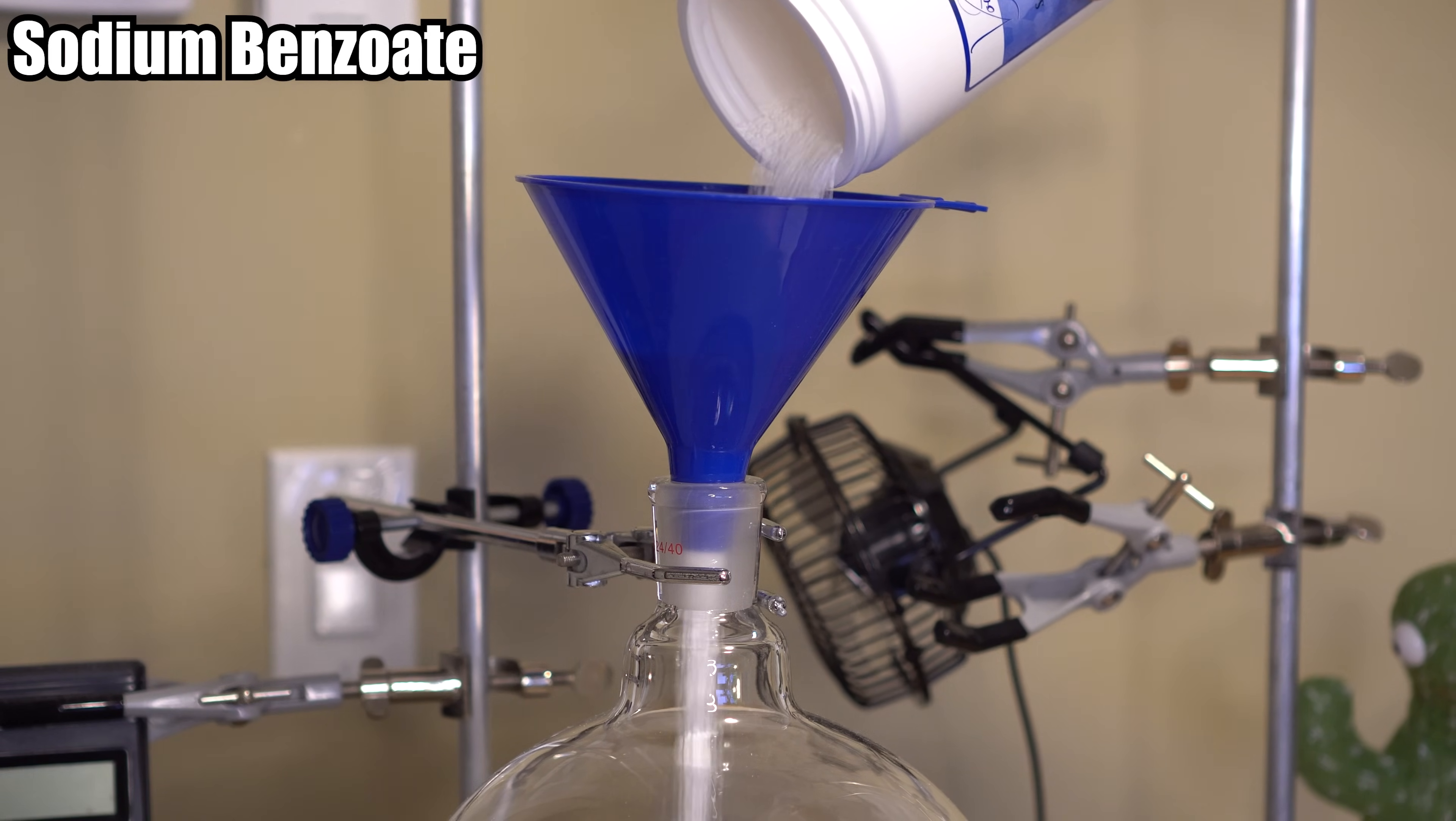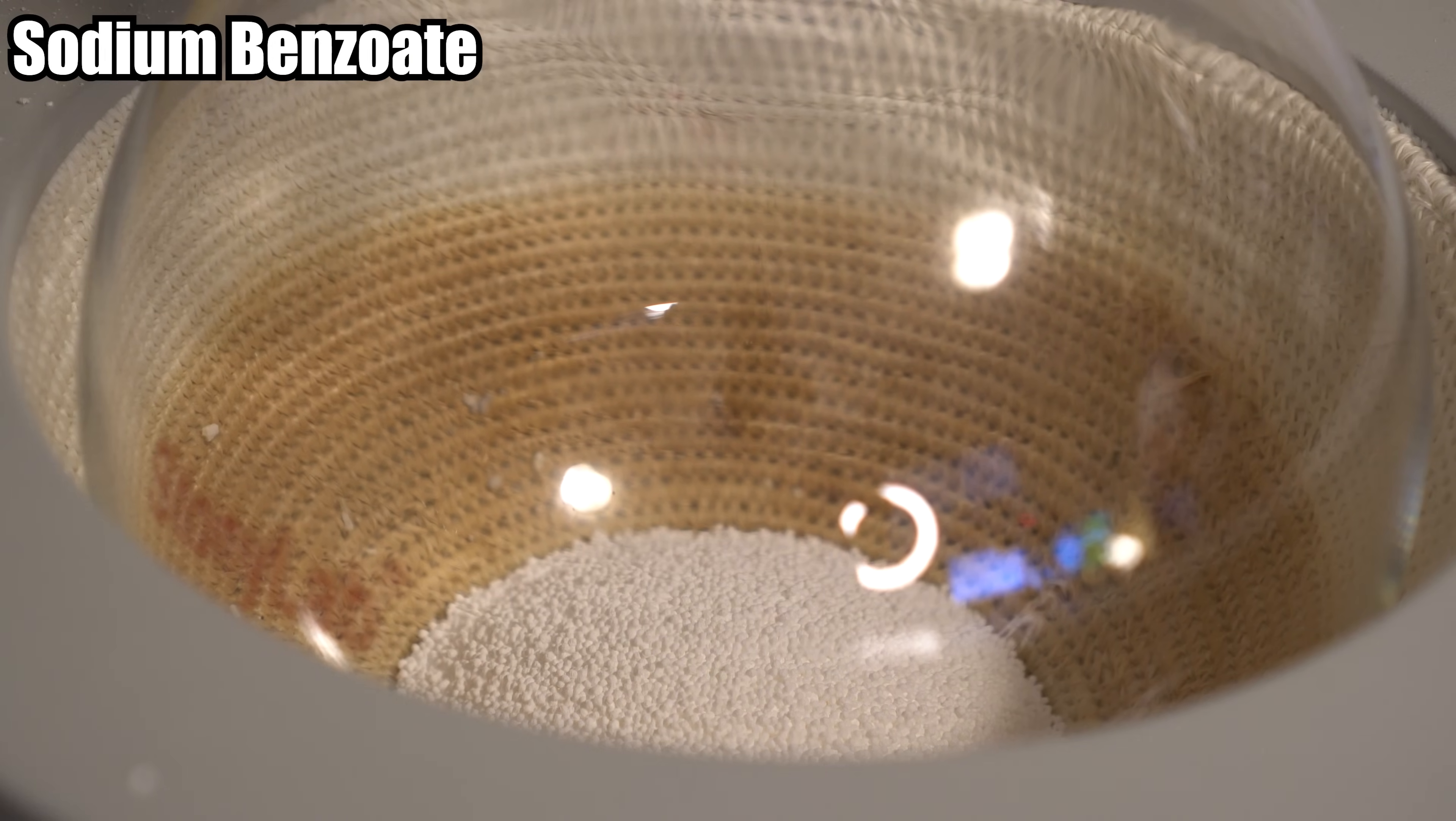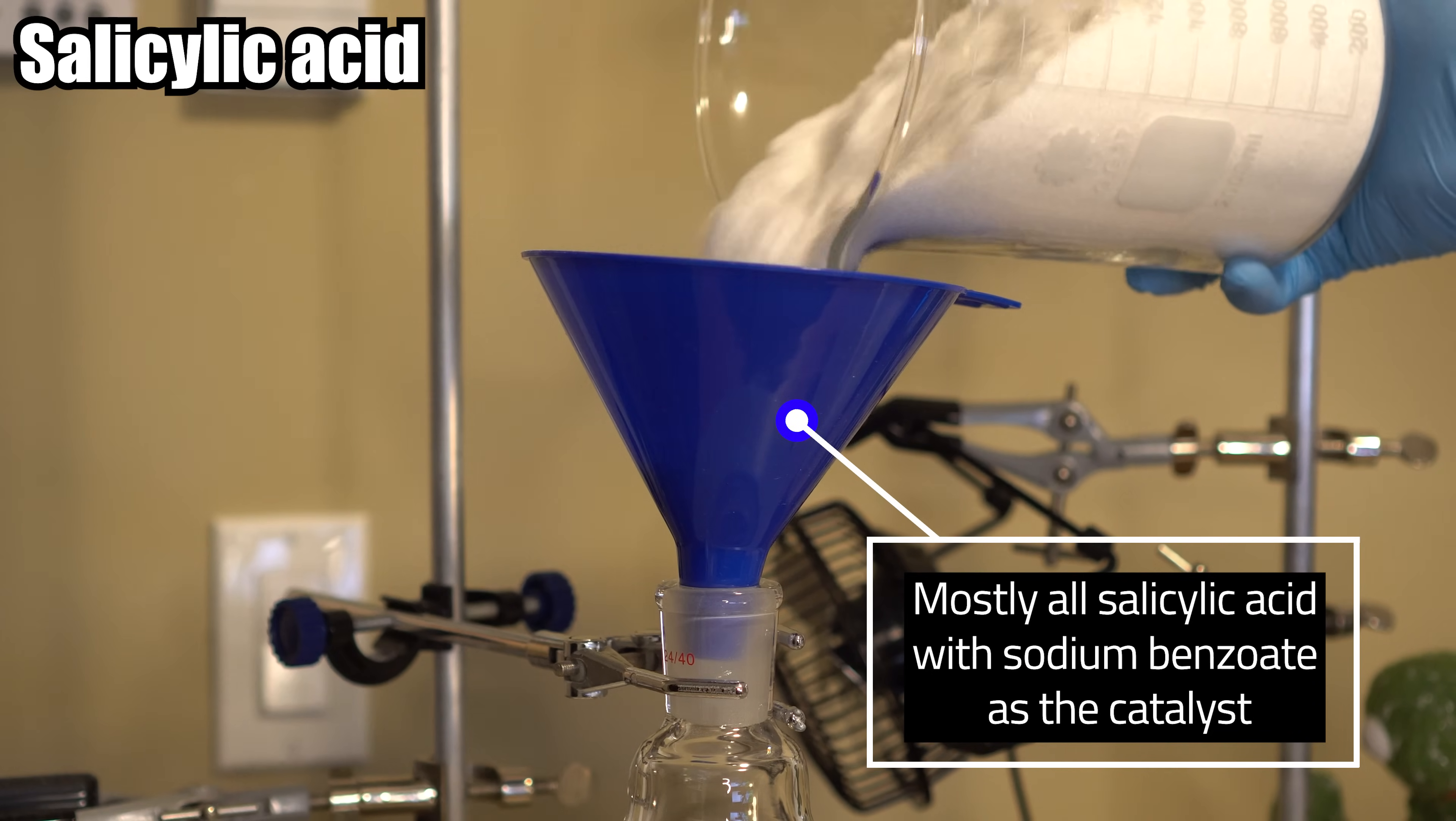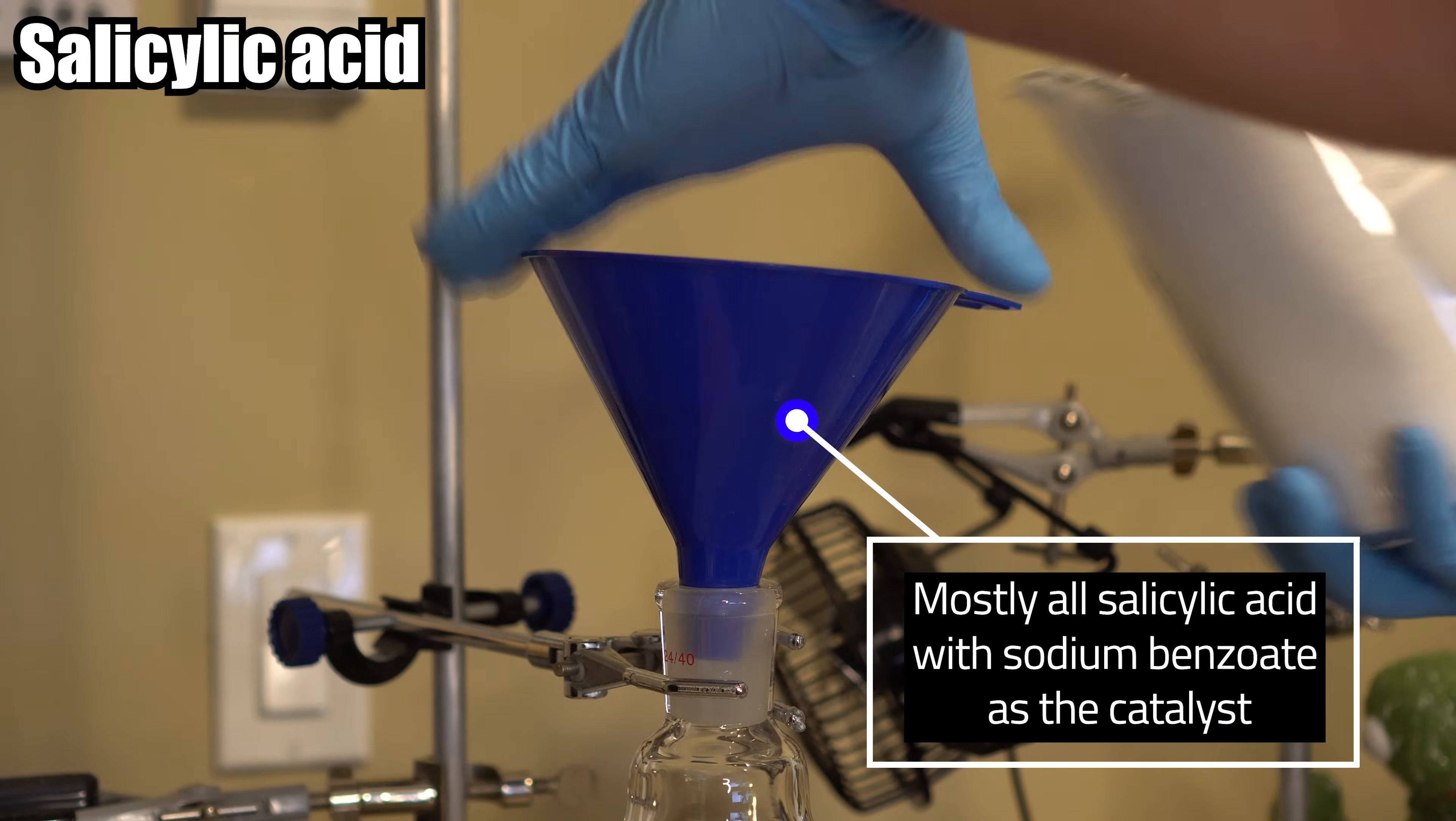He started off by pouring sodium benzoate into a 5 liter round bottom boiling flask as the catalyst. He took a big bag of suspicious white powder, which he said was salicylic acid, and he put that into the 5 liter as well.